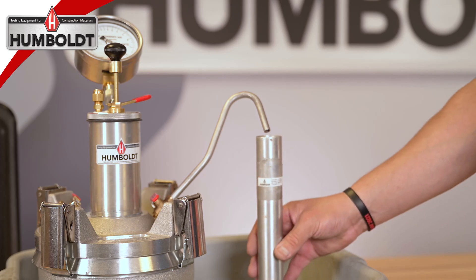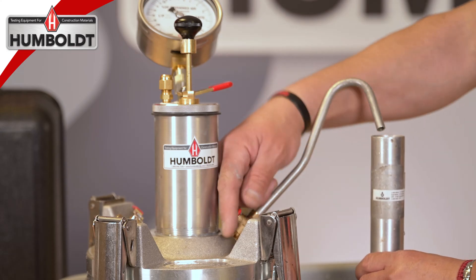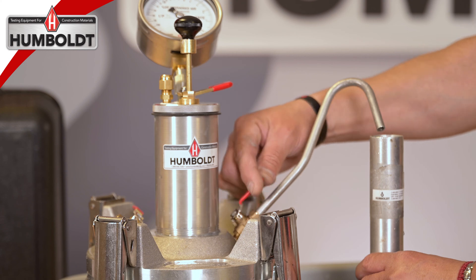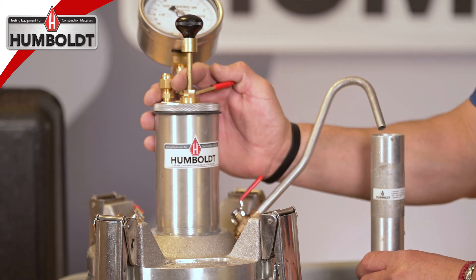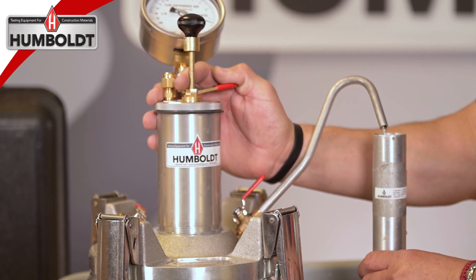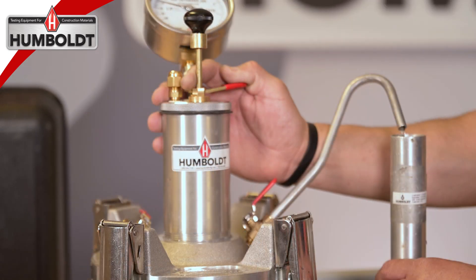Place the calibration vessel directly under the calibration tube and open the pet cock. Slowly press down on the needle valve lever to begin filling the calibration vessel with water. Continue until the water in the calibration vessel is level with the top edge.